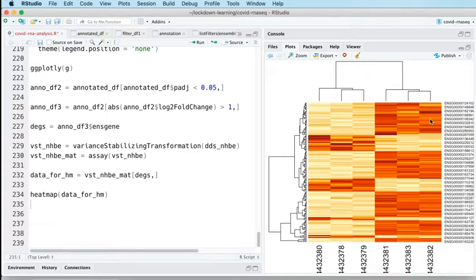So there's a package called gplots, which has a function called heatmap.2, which comes with things like a key automatically and various other ways of configuring the heat map to make it slightly better than this one. Then there are packages built specifically just for producing heat maps, and some really good ones as well. So pheatmap is one of those, and ComplexHeatmap is another one, which really does, as the name suggests, let you build very, very complicated heat maps.